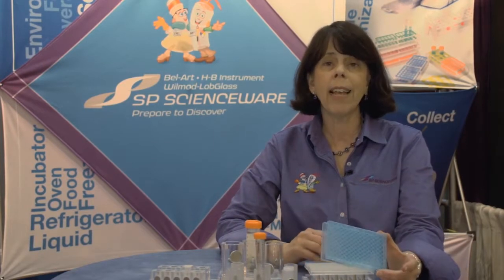There are tube racks for 50ml centrifuge tubes, 15 or 5ml centrifuge tubes, and 1.5 and 2ml microtubes, as well as two microplate racks — one for PCR microplates and PCR strips, and one that fits any standard flat bottom microplate, no matter how many wells it has.